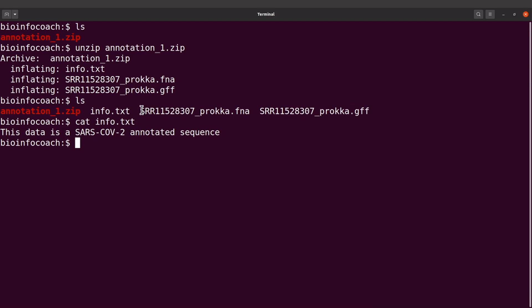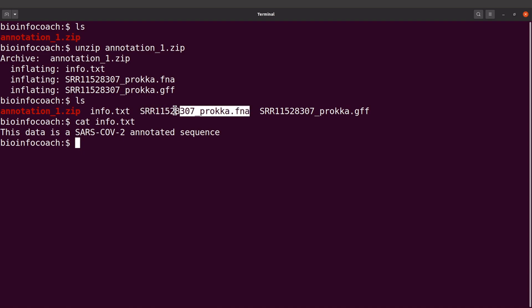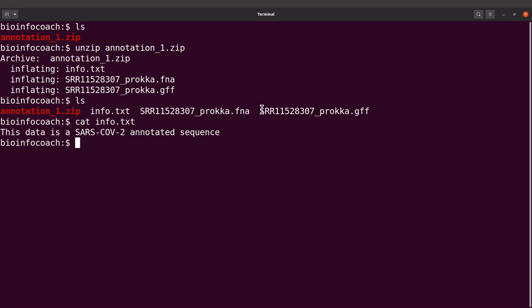We have a .fna file which is a FASTA file containing the genome sequence, and we also have a GFF file. In that tutorial I annotated a sequence — the sequence is in the FASTA file and the features are in the GFF file. We are going to load both into JBrowse and visualize the result.